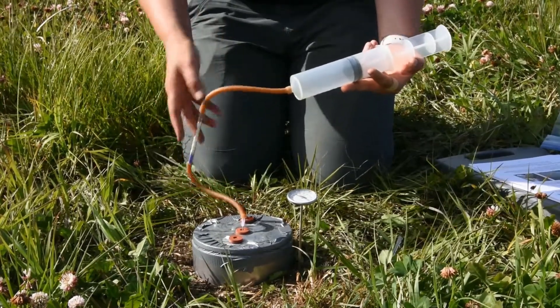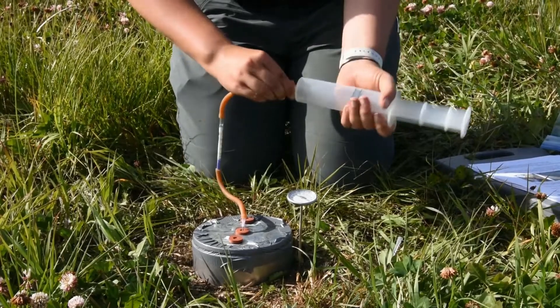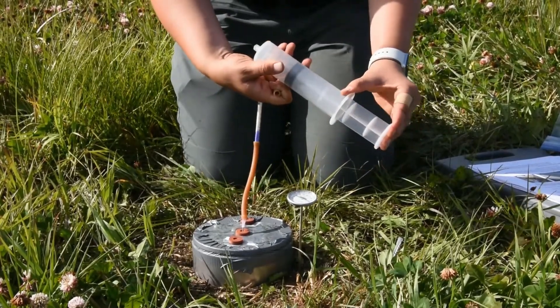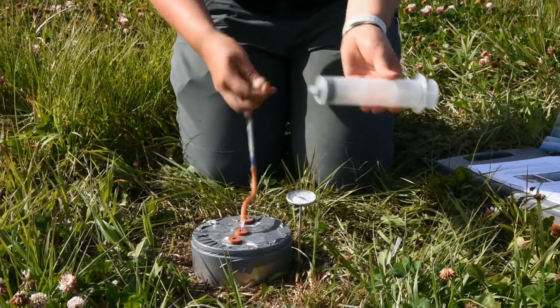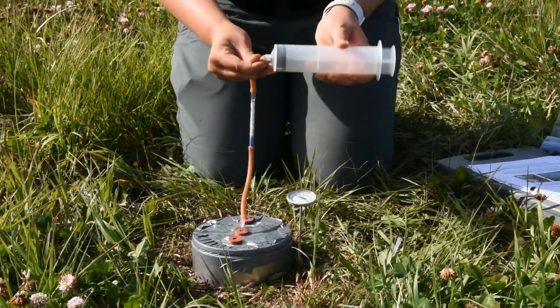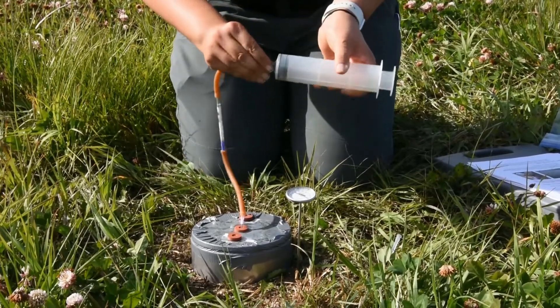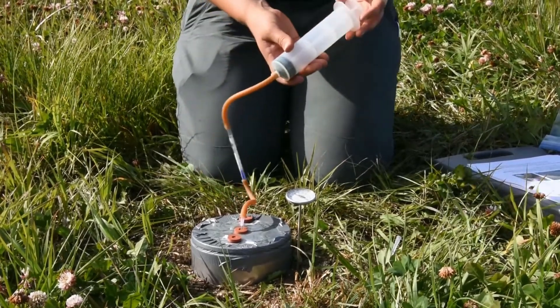To reset your syringe, you're going to need to unattach the tube from the syringe itself, push the air out, and reattach from there. And you're ready to start again.